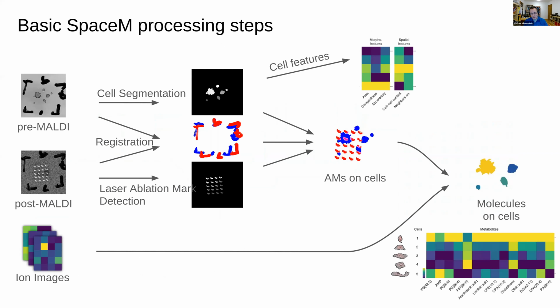This is where Theo left off. I'll go into a bit more detail to see what image analysis steps we have. This is sort of a toy example of how you would do single cell metabolomics with Luca Rappez's method. On a little toy example where you just have 5 by 5 pixels or whatever, 6 by 4 and a few cells. So you would go to the microscope and take an image before you do any mass spec imaging.